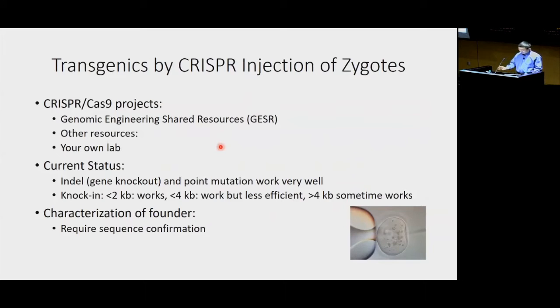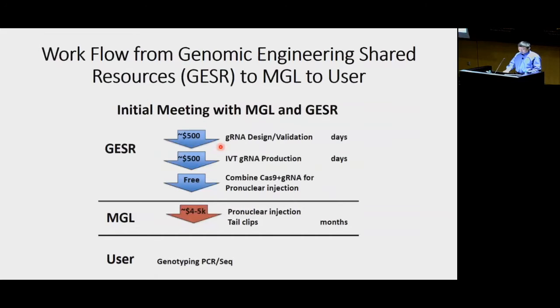So that's another issue. Here's a workflow I copied from the Genome Engineering Shared Resource about how long it may take and what the cost is.